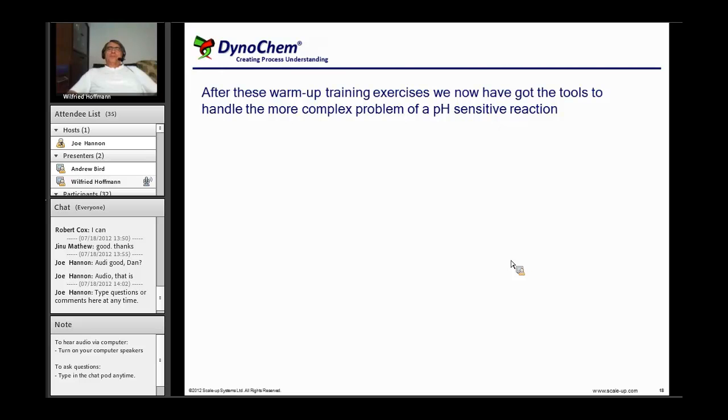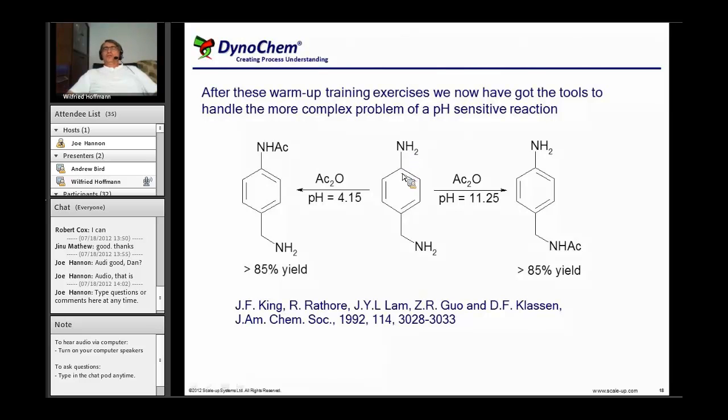Now we want to approach the problem of pH-sensitive reactions and selected from literature the acylation of 4-aminobenzylamine. Literature tells that when you add an equivalent of acetic anhydride, depending on the pH of your reaction solution, you will get either predominantly acylation of the benzylamine nitrogen when you work with alkaline pHs around 11, or you get predominantly the aniline being acylated when you work at pHs around 4. What we would like to do is get the necessary understanding of why that's true and generate a DynoChem model which can predict exactly these findings.